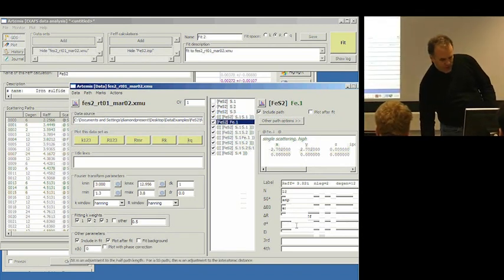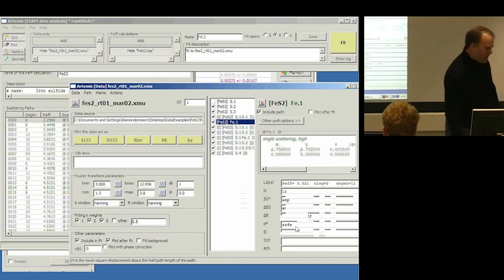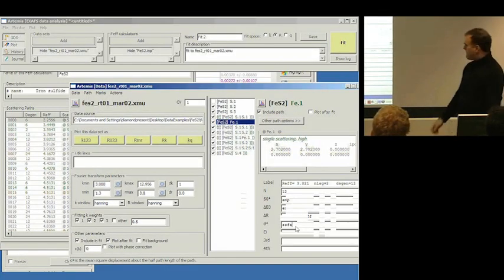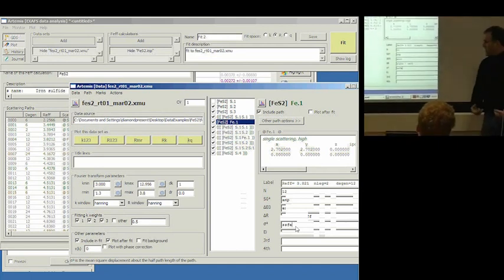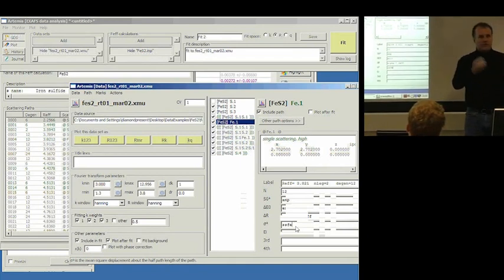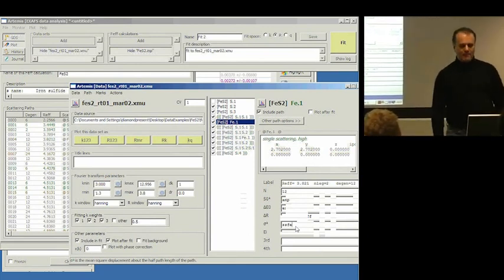And for the iron one, I'm going to call it SSFE. So, a moment to talk about nomenclature. None of these words that I've selected, with the exception of ref, which has a special meaning, none of the rest of these terms have any particular meaning. That is, you get to choose the names of your parameters. I chose the name amp, but it doesn't have to be amp. I can call it something else, right?